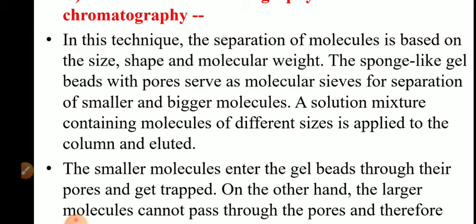A sieve is like when you prepare tea, you sieve it so as to separate the solid tea particles from the liquid tea. Like that, the sponge-like beads are porous. They have pores on their surface. The pores serve as molecular sieves for separation of smaller and bigger molecules.